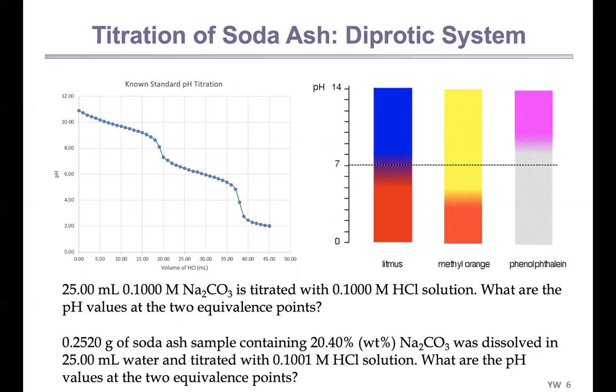At the equivalence point, the pH will change a lot, so you see the sudden drop of pH. Of course, in this example you're titrating a base with the acid, so the pH will keep decreasing all the way. If you're using a base to titrate an acid, then the pH will increase all the way, right?